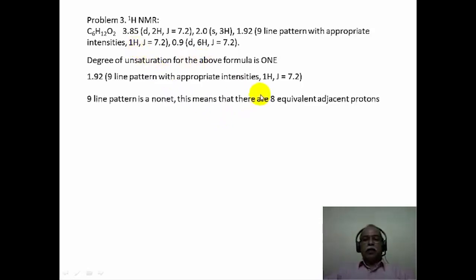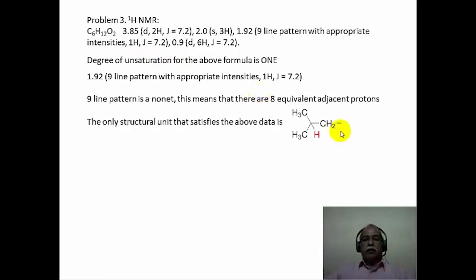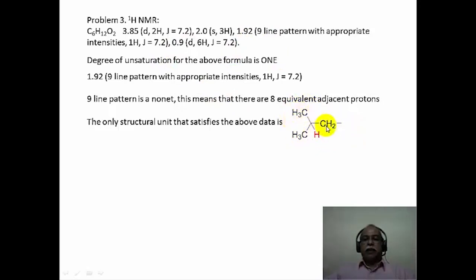The only possible structural unit that satisfies this data is the isobutyl group, where the red hydrogen corresponds to the signal at 1.92 ppm, surrounded by 2 methyl groups and a methylene group. Totally there are 8 vicinal hydrogens which split this red hydrogen into a 9-line pattern with an average J value of about 7.2 Hz.